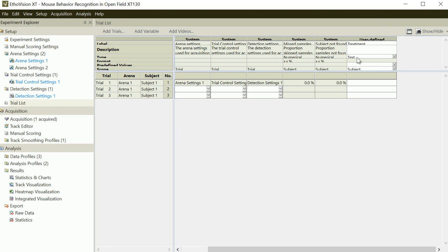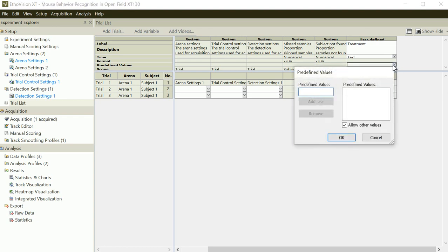treatment, which is a text information, and you can also select a numerical or timestamp or something, which is subject to a subject animal. And with pressing this button, you can make your label as you like.